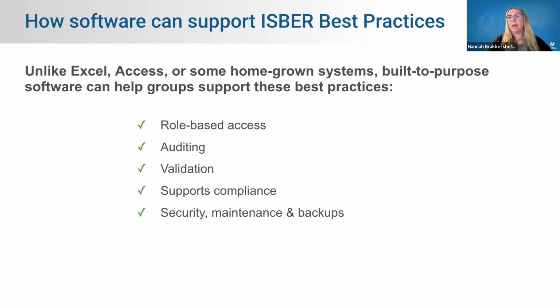This means that these software systems can come equipped with things like role-based access control, which helps ensure that the right people have the right permissions, audit trails for full traceability of sample handling and system activity, and data validation tools that help reduce errors and maintain data integrity, as well as compliance features to support those standards.